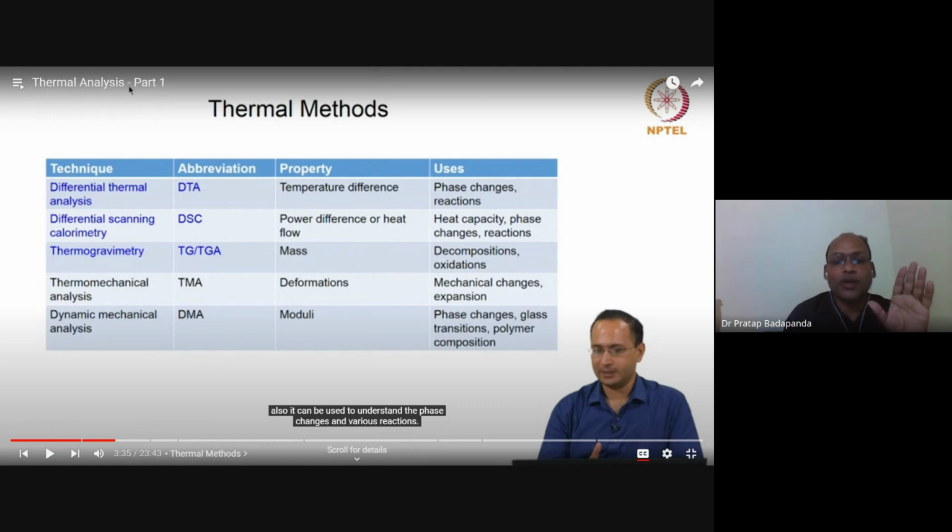So that is differential thermal analysis, scanning calorimetry, and thermometric titration. So this video contains all the things, all the three phases. You have to go through this video once, then I will come to the titration, what is the stepwise process, what to do, everything.